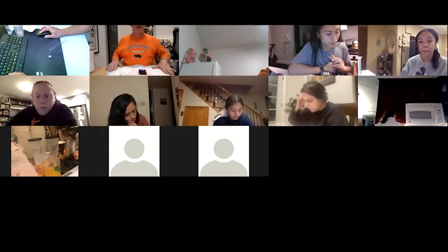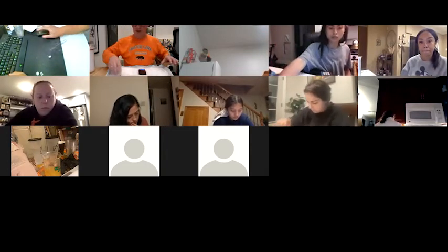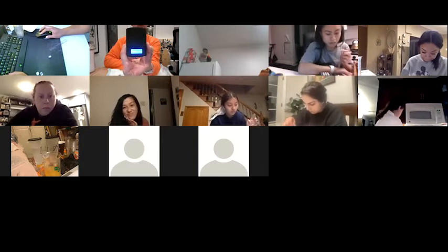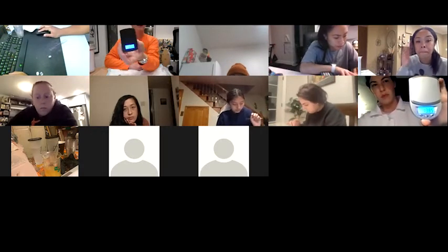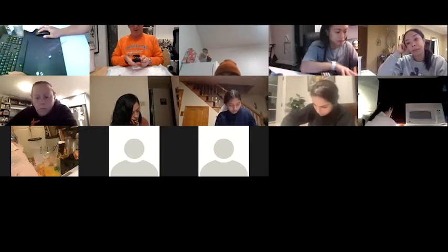All right, so I've calculated my volumes. Hopefully you've calculated your volumes at this point. I'm not sure which balance you have. Does it look like this or is it a white one? All right, yes, this is the one we got last year. It still works, so I figured I would use it. So a couple things.